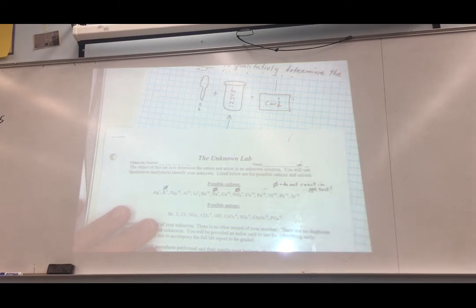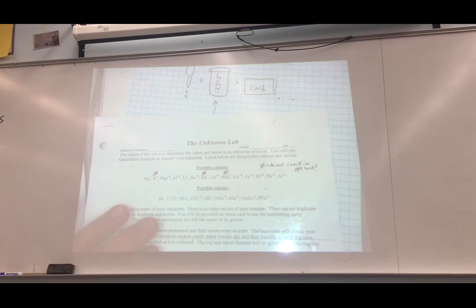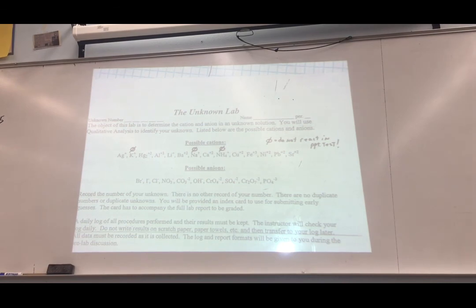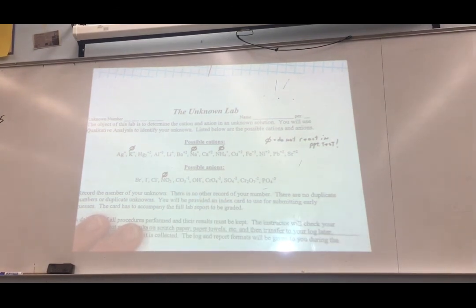Very important piece of information. Potassium, sodium, and ammonium do not react in the precipitation test. And nitrate does not react in the precipitation test.